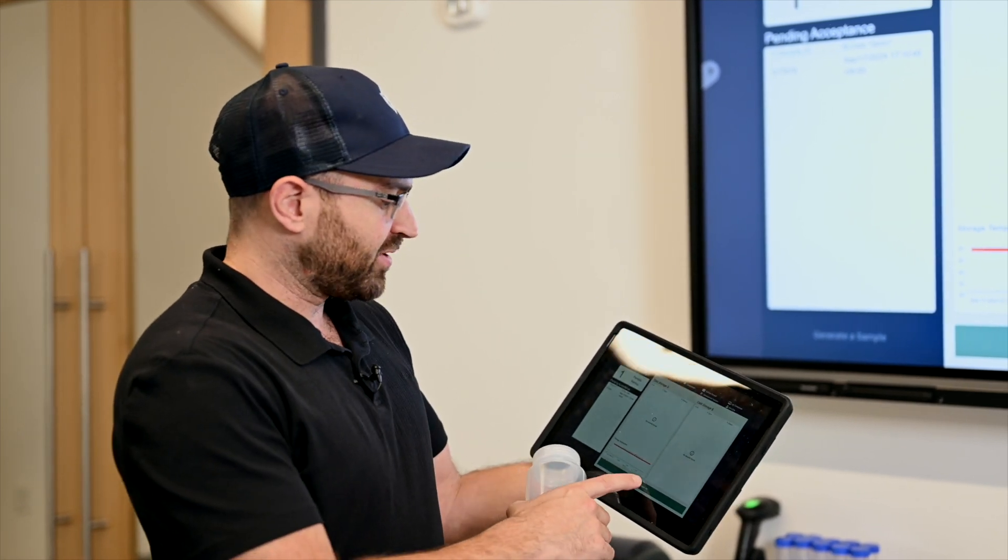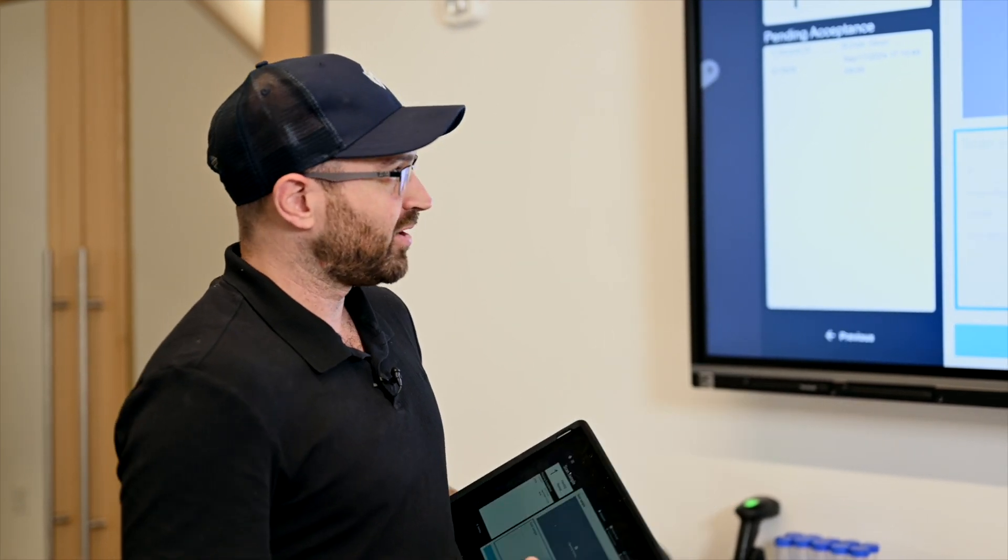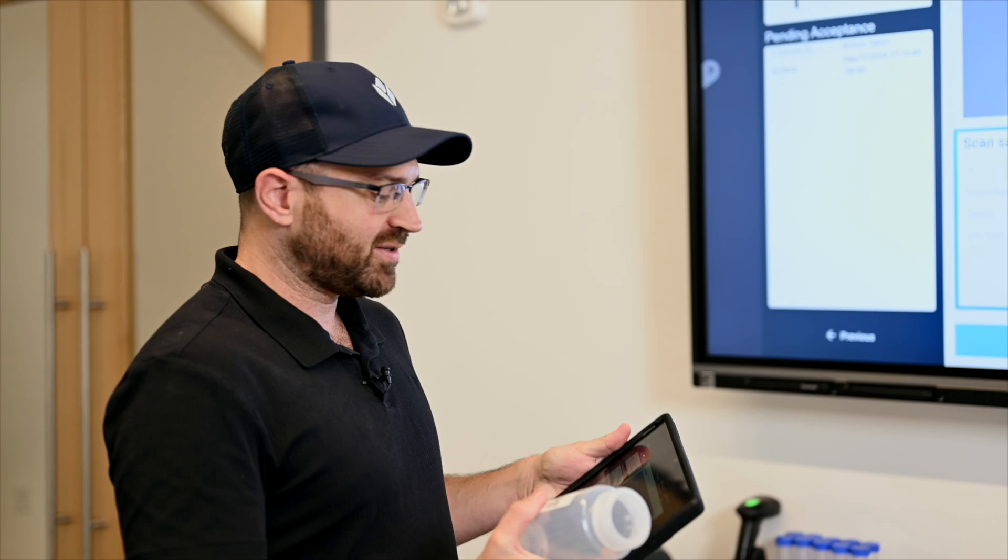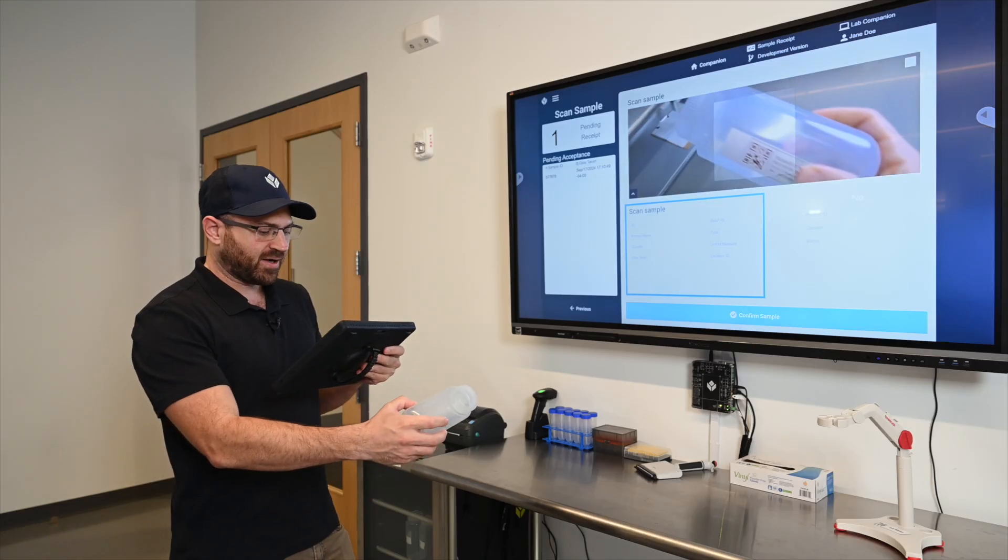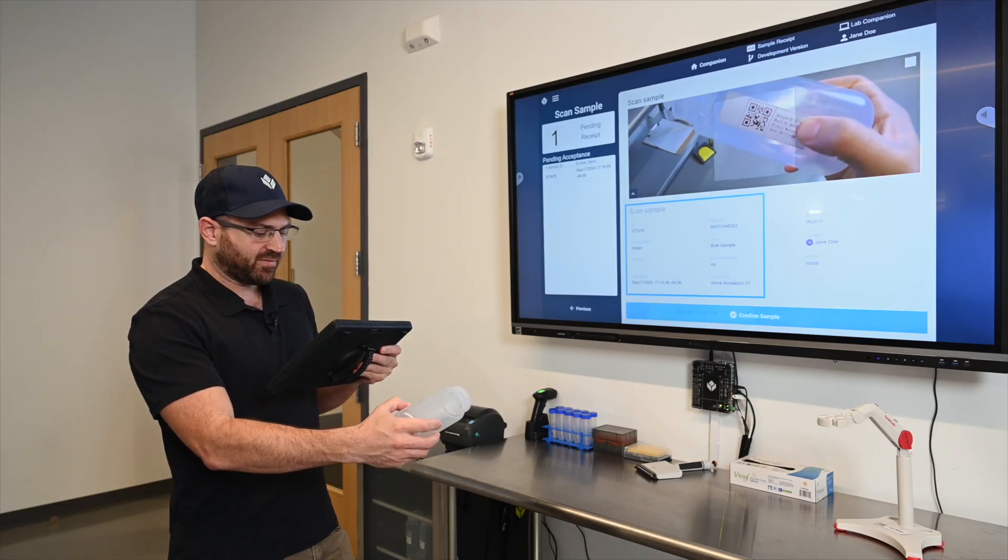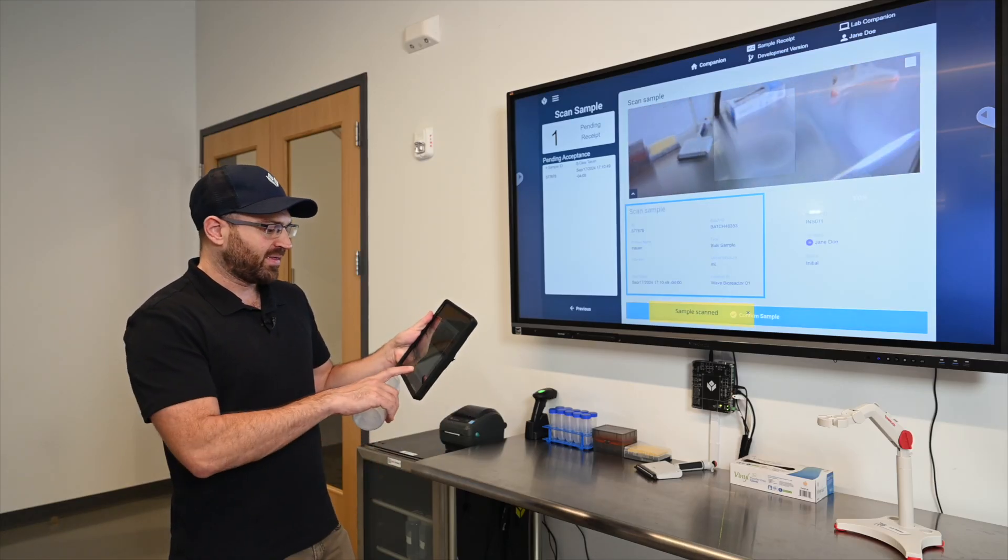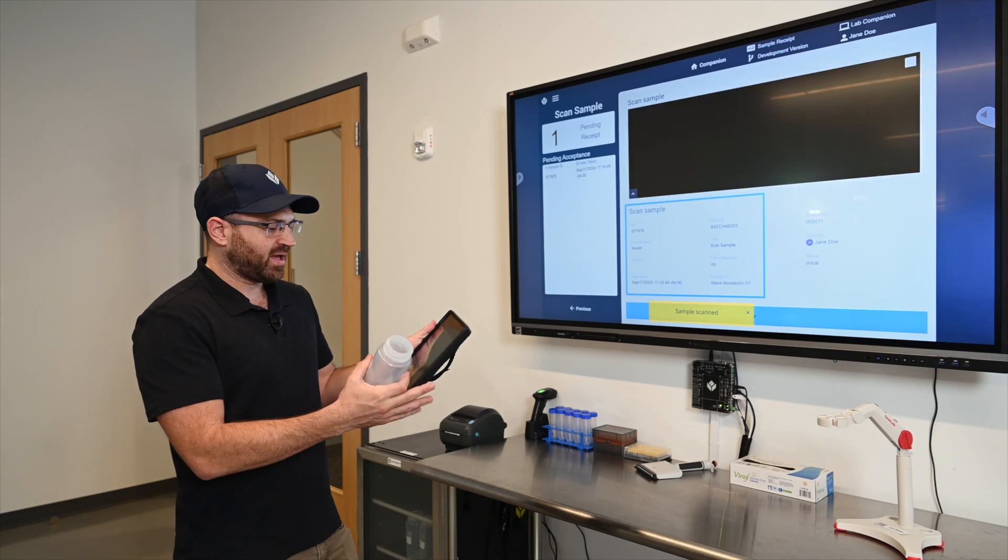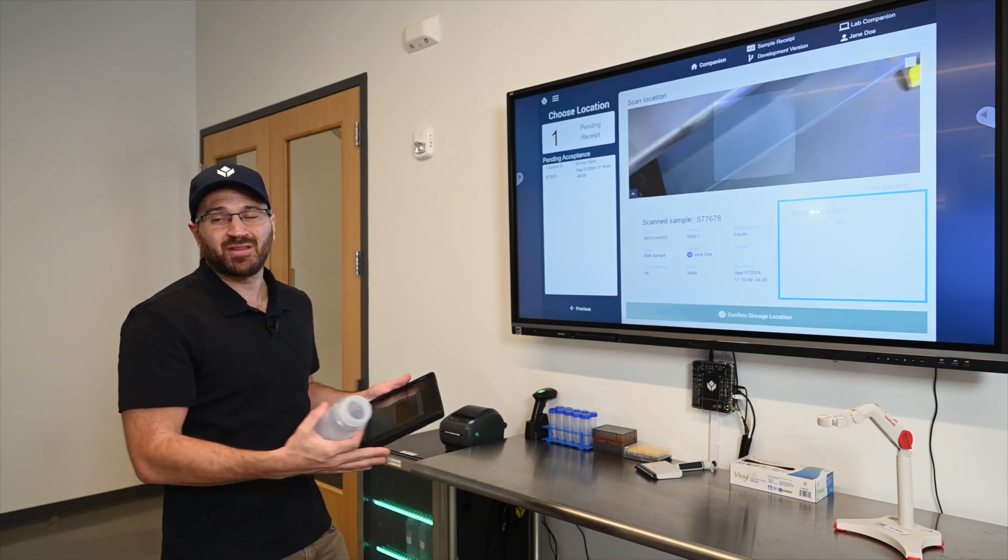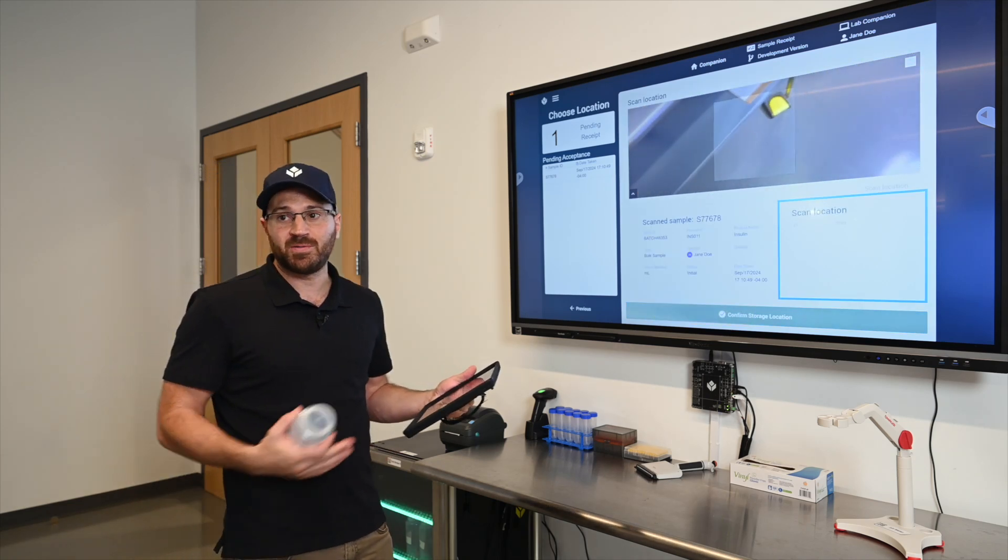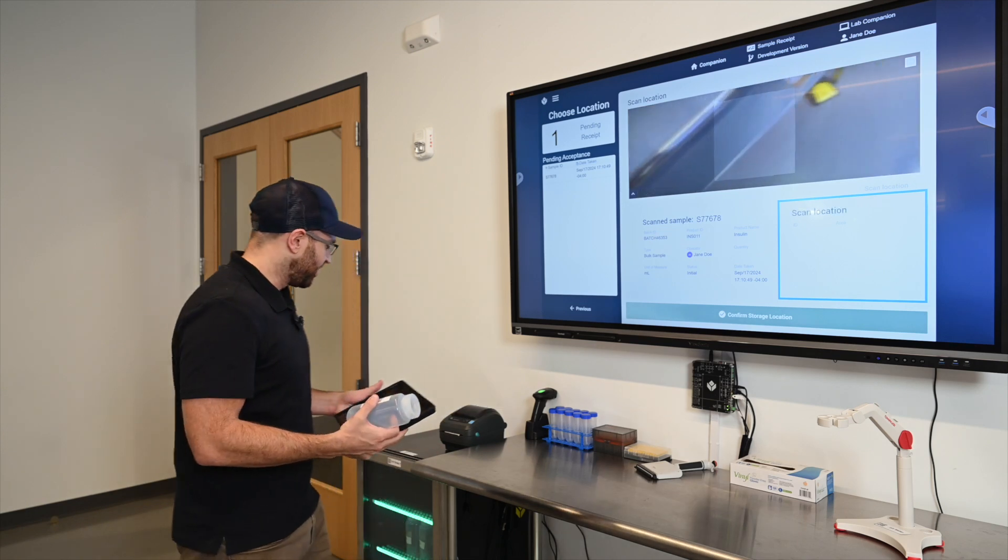First things first, we want to actually accept this into the lab and put it into storage. So I will press receive sample and I'm going to use the camera that's on this tablet to verify which sample I have. I've scanned it in and I'm going to confirm that and scan it into the location.